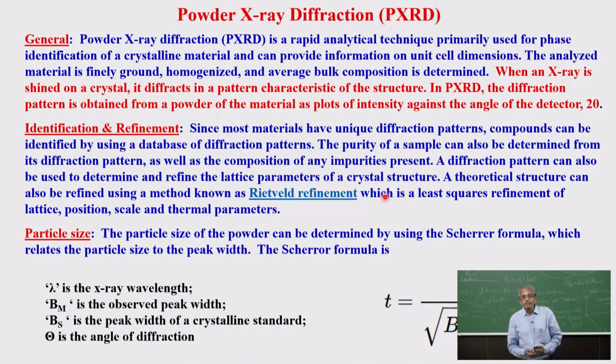That is what is called the pattern. So the diffraction pattern is very unique to that particular lattice, not only to the type of the lattice but also the type of the atoms present. Why? We already studied in the beginning of this lecture that the strength of the diffraction depends upon the number of electrons present in the scatterer, which is called the atom. So if you have one atom and another different atom, obviously if their number of electrons is more, the scattering strength is more, and that means your intensity pattern differs. Therefore you have very unique X-ray diffraction patterns.